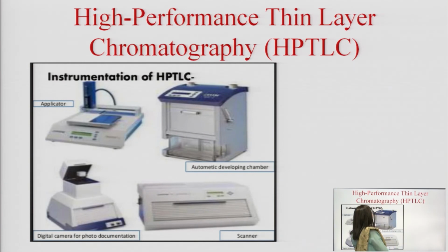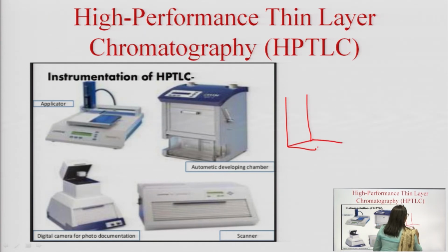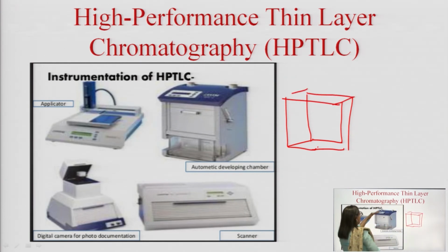So, these are the display of the instruments. As said, in TLC we are having simple glass developmental tanks, while in HPTLC we have these specialized automatic developmental chambers where the solvent system is kept here and the aluminum plate pre-coated with adsorbent is kept vertically in this development chamber.